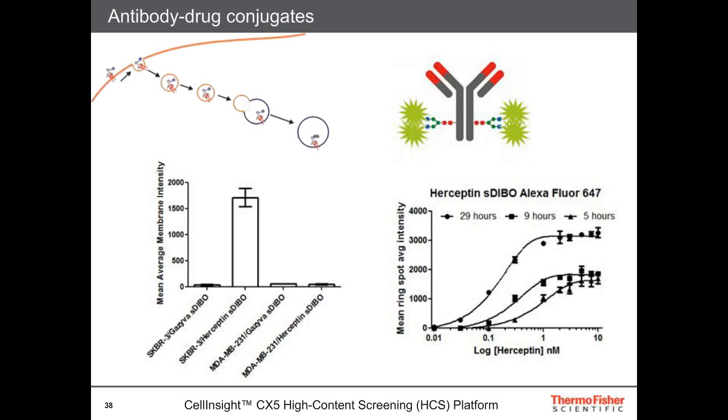These are SKBR cells, so HER2 positive. We can label them for 29 hours or 9 hours or 5 hours and look at both the time and dose dependency of the uptake as well.